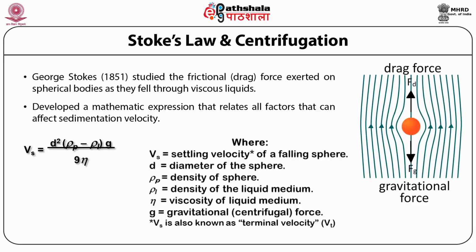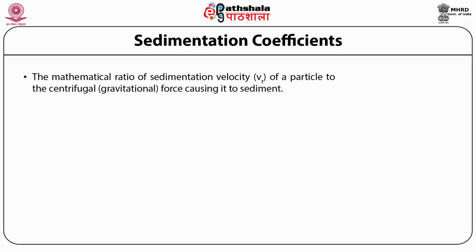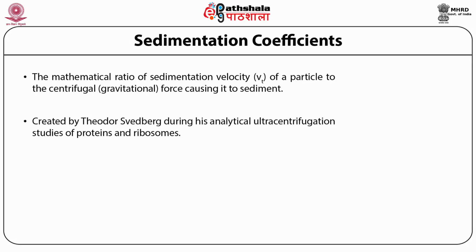Then the viscosity of the medium is equally essential because it applies the friction force, so the force acting on the particle is different. That's why it separates the molecules, and G is the gravitational centrifugal force. We are going to discuss the sedimentation coefficient of the molecule, because different molecules have different sedimentation coefficients.